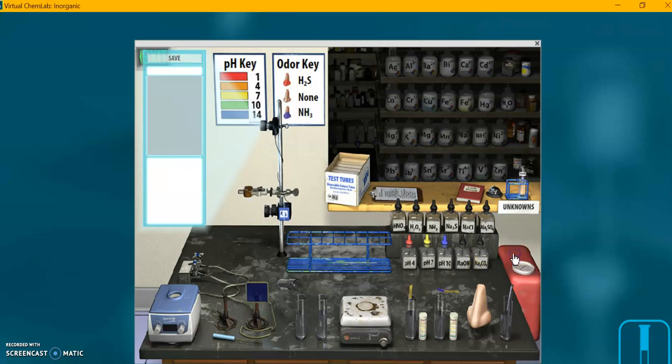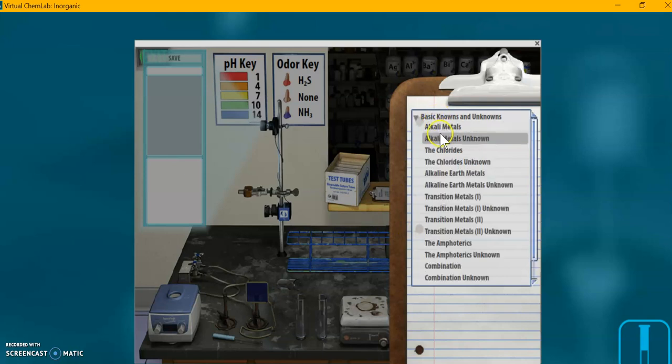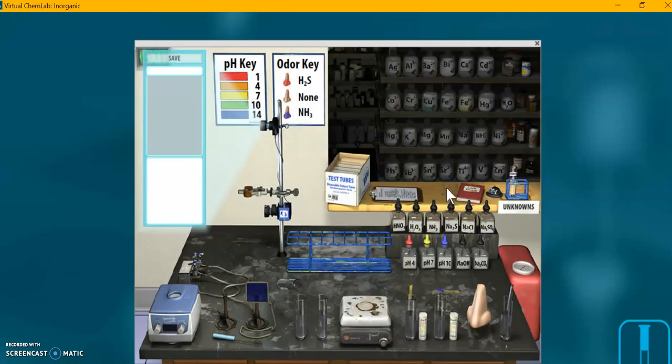I'm going to clear the lab, click on the clipboard, go to basic knowns and unknowns, and alkaline earth metal unknowns. Do your real unknown just like you did your practice unknown. And don't forget to record your unknown number in the close-up window. And that's it. Okay. So here we are.